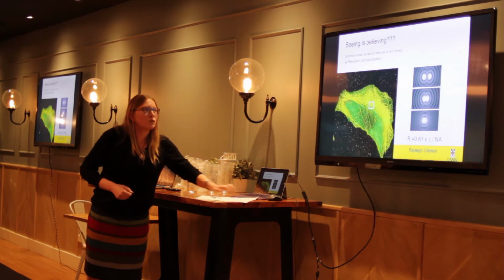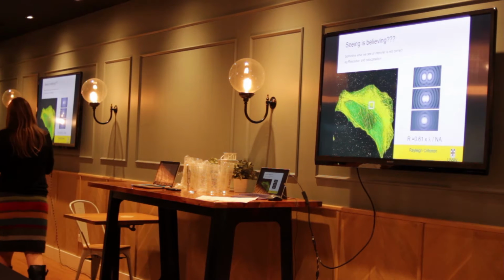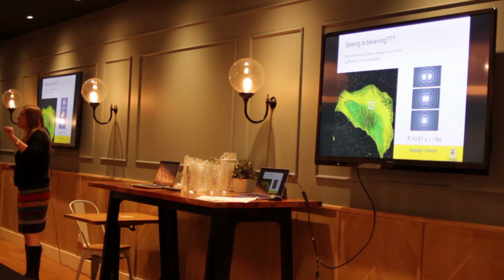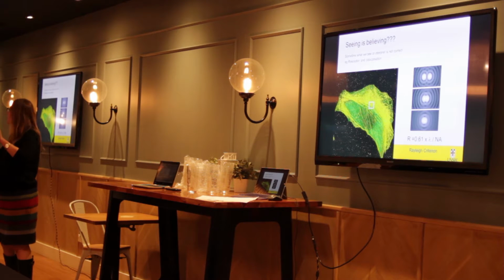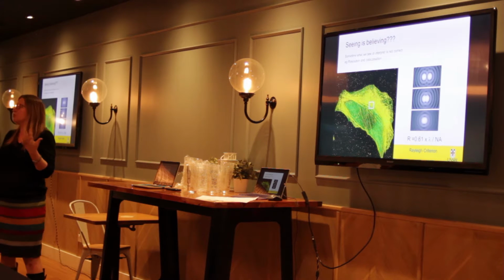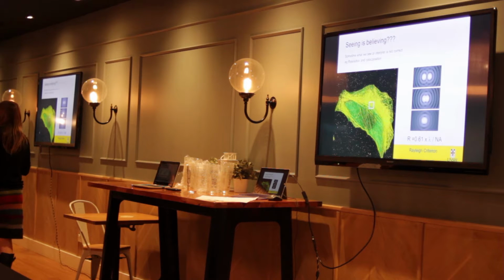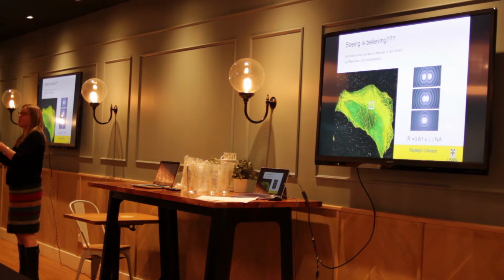However, we can't always trust it, right? So, you have a look at the image there. What you're looking at is a cell that's got one item labelled with red and one item that's labelled with green. When you lay these over on an image, they end up being yellow. This is the way they combine in the image. Now, if we see yellow in a pixel, what that tells us is those two things are together. Okay? They're interacting.